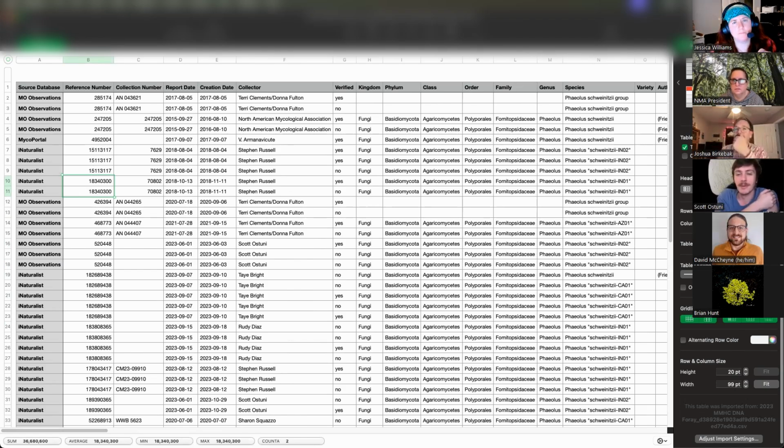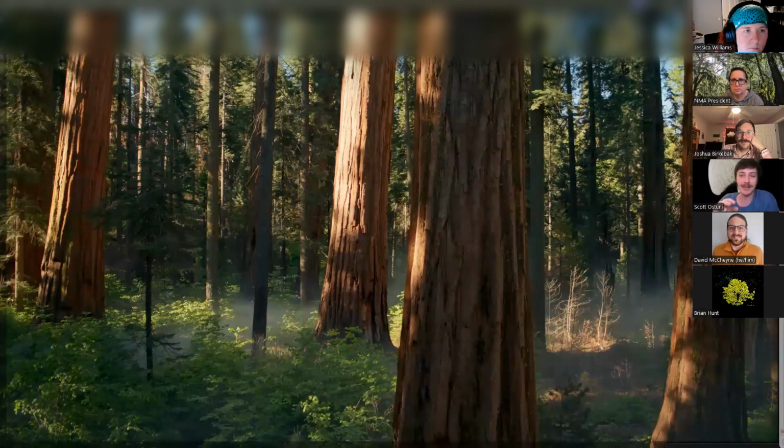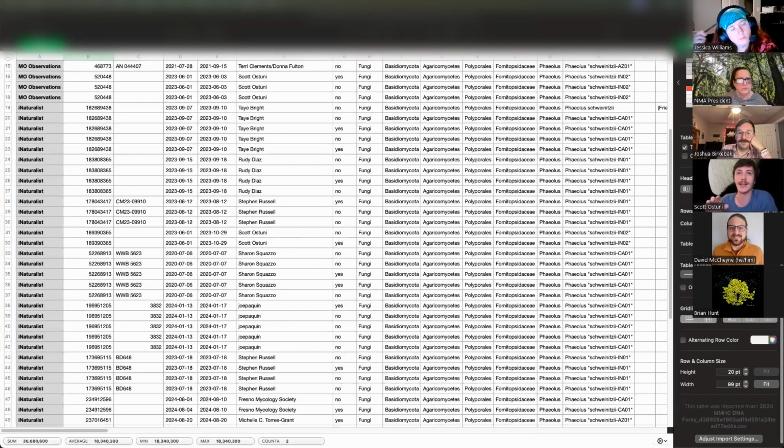Go ahead, Scott. Yeah, I have a feeling. Something weird that MycoMap does is, let's say Kyle uploads a run, and he's got a sequence attached to it, and then you do the whole import to INAT thing.